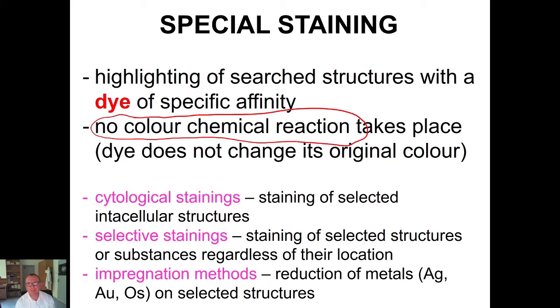If there is a chemical reaction with the change of color during the formation of the slide, it isn't staining but a histochemical reaction. I will speak about histochemistry next time in the special techniques.